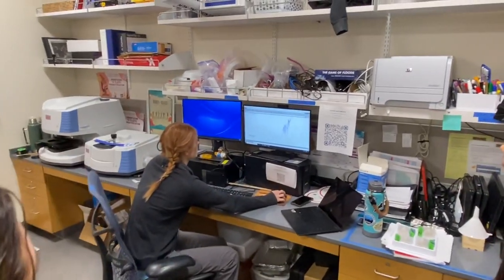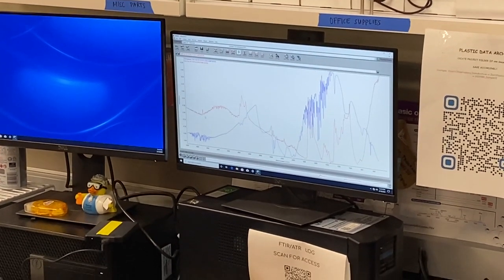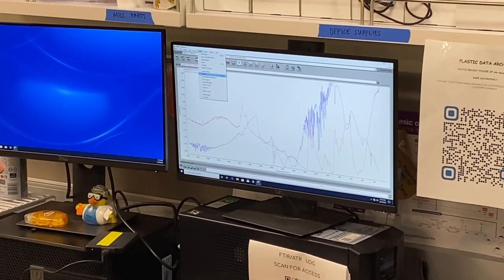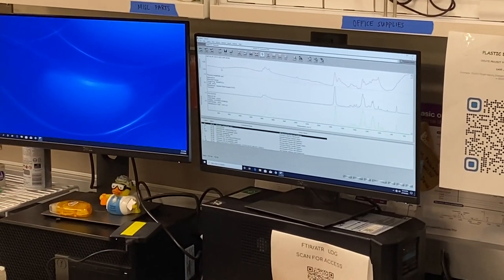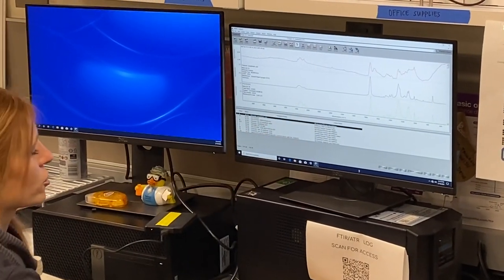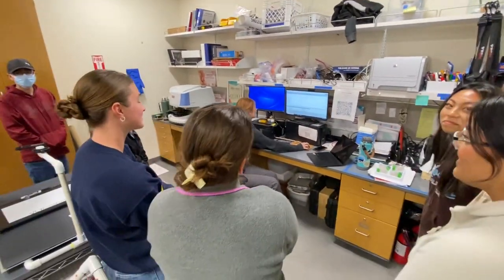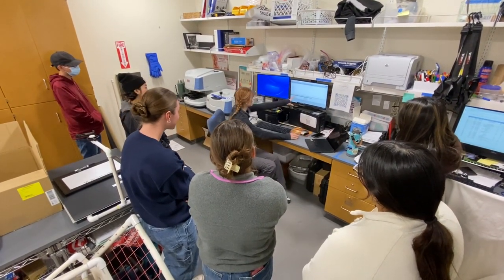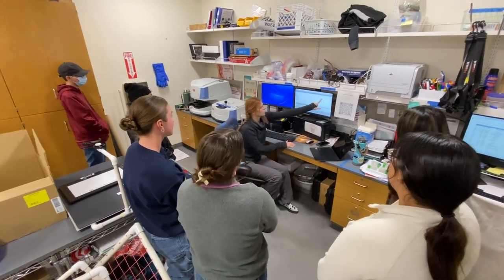So here we go — it's measuring up against this background. We're going to go over to analyze, search. We're going to search it. It says it's polyester, 68% polyester. And then all of these other ones say polyester — ignore cocaine, because the Georgia State Crime Lab Library thinks everything is drugs. It thinks everything is some kind of opioid or something like that. It's just one of the libraries we have in here, and yeah, it thinks everything is drugs.